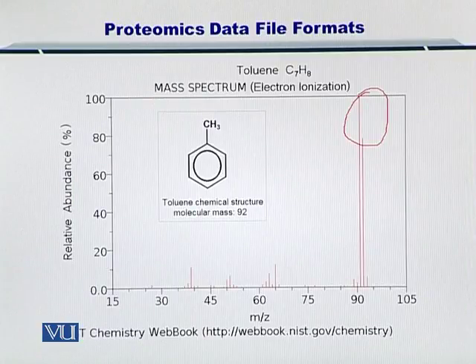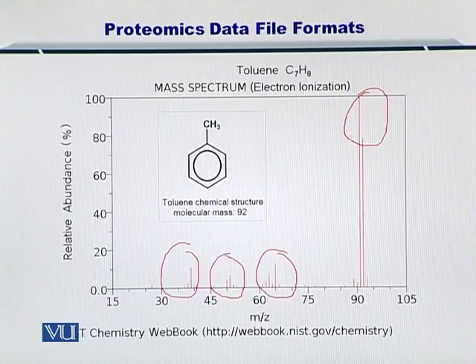So this molecule may have been protonated or deprotonated to be represented by these two peaks, and this is how the mass spectrum looks like. As you can see, there are some other peaks as well that are reported. So these may just be fragments of this molecule, or in this case, the smaller peaks, these can be the other isotopes that are forming toluene.